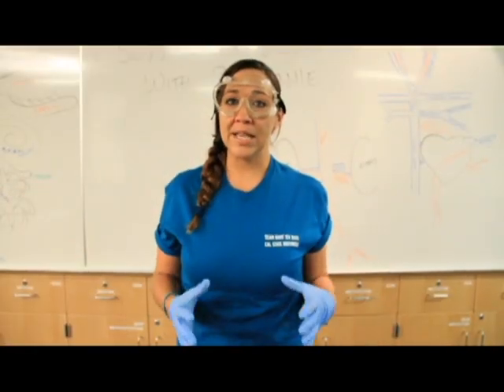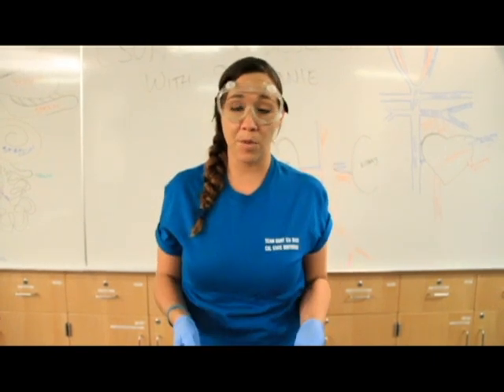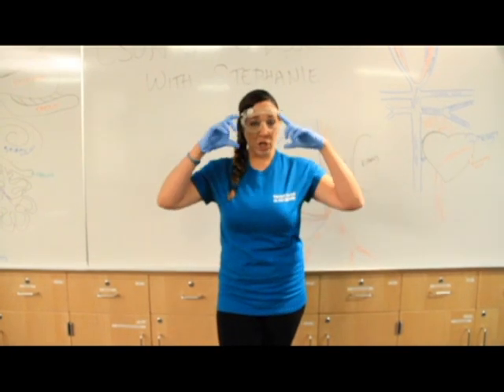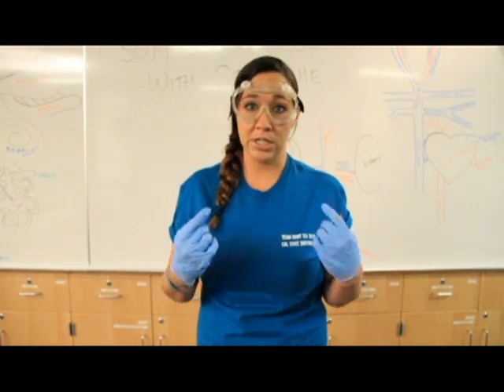Once we take the pigs out of the bag, that's when you have to have your goggles on. Anytime you're working closely with the pig, the goggles must be on. If you need to take a step back or go get some fresh air, you can take the goggles off, no problem. But if you are working with the pig up close, you need to have the goggles on.